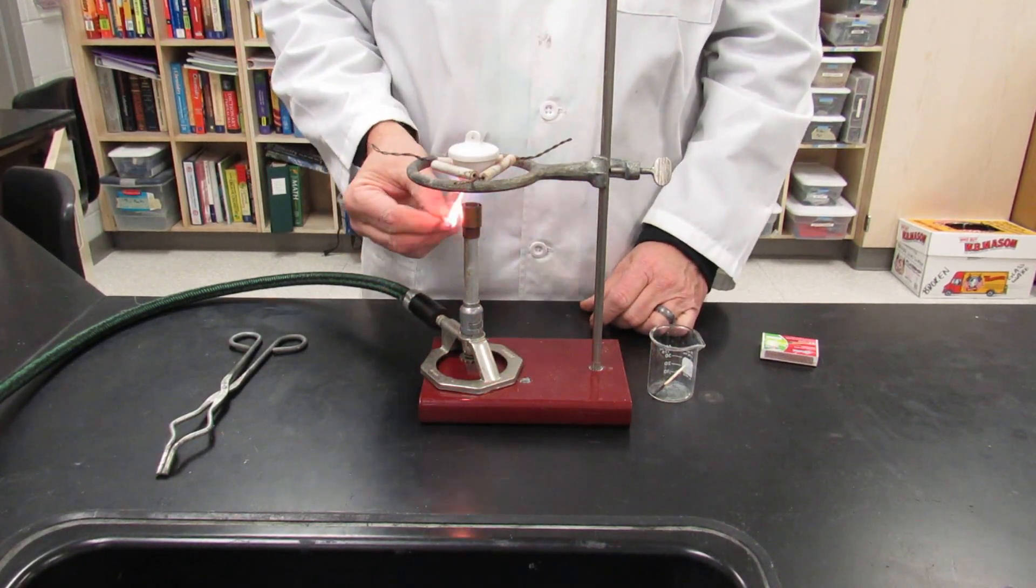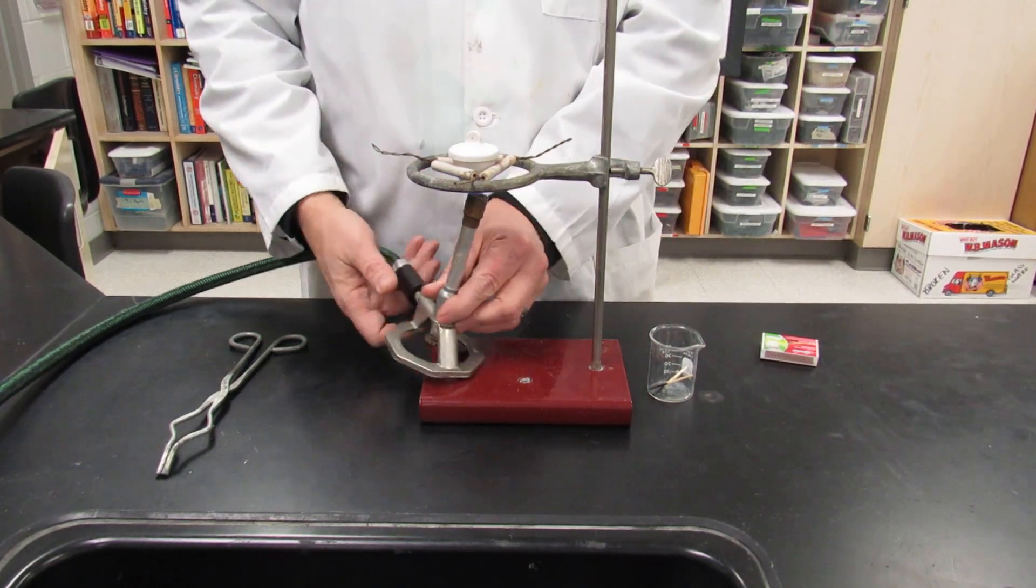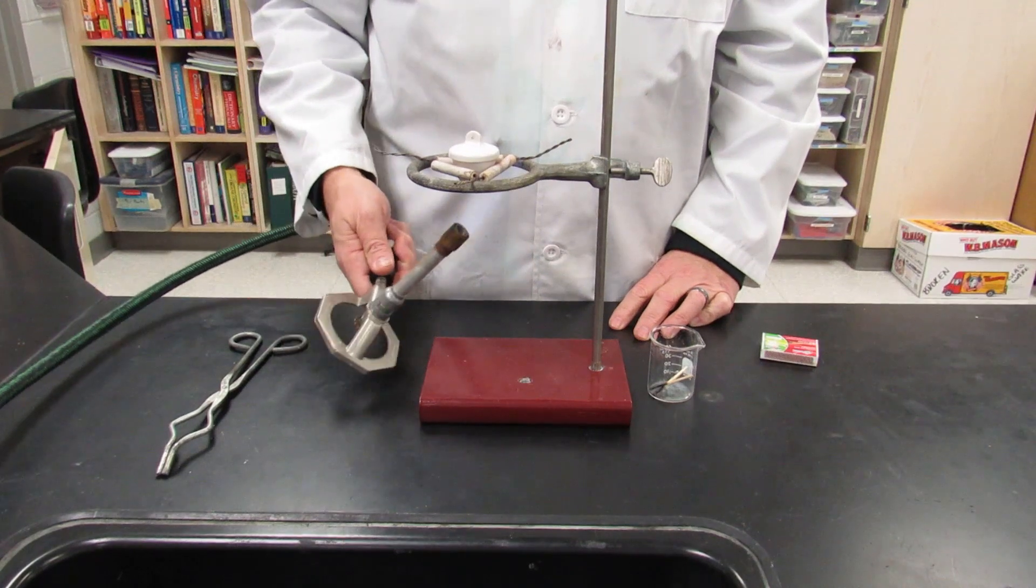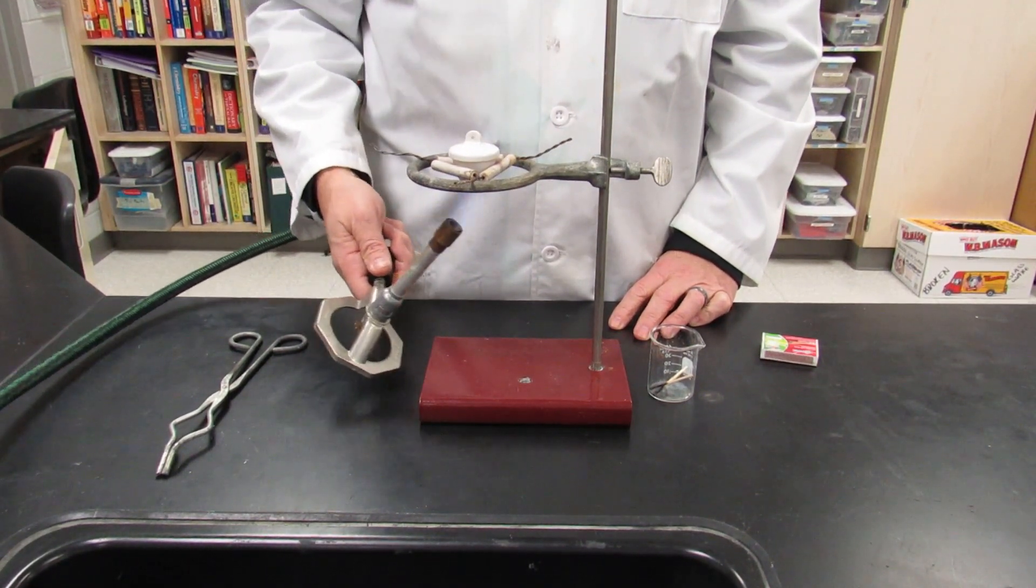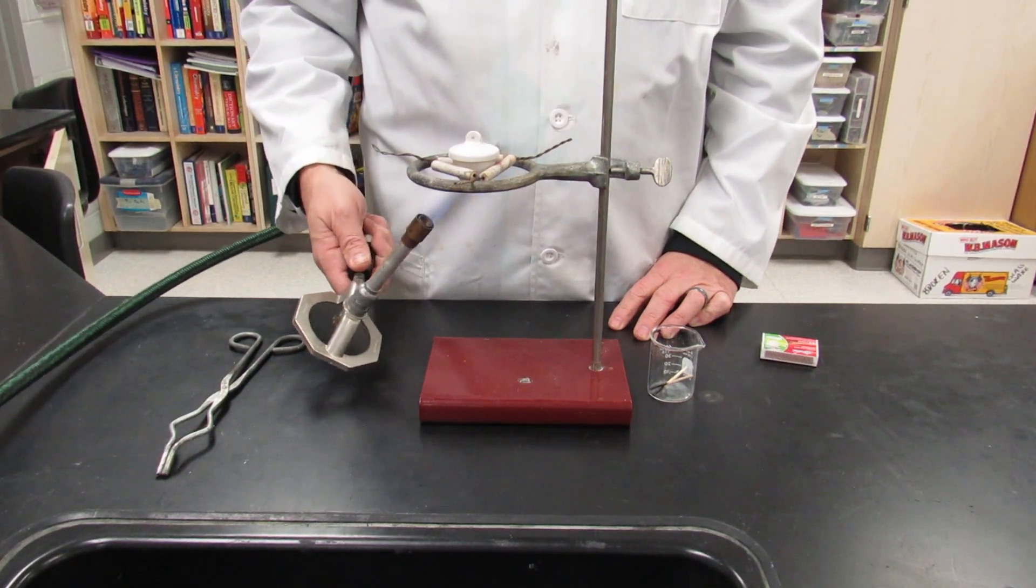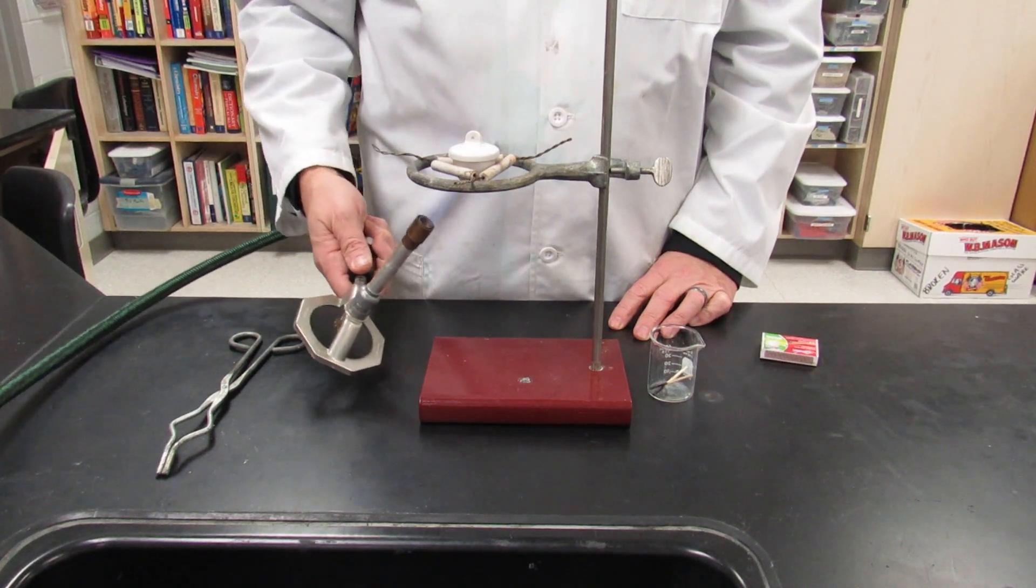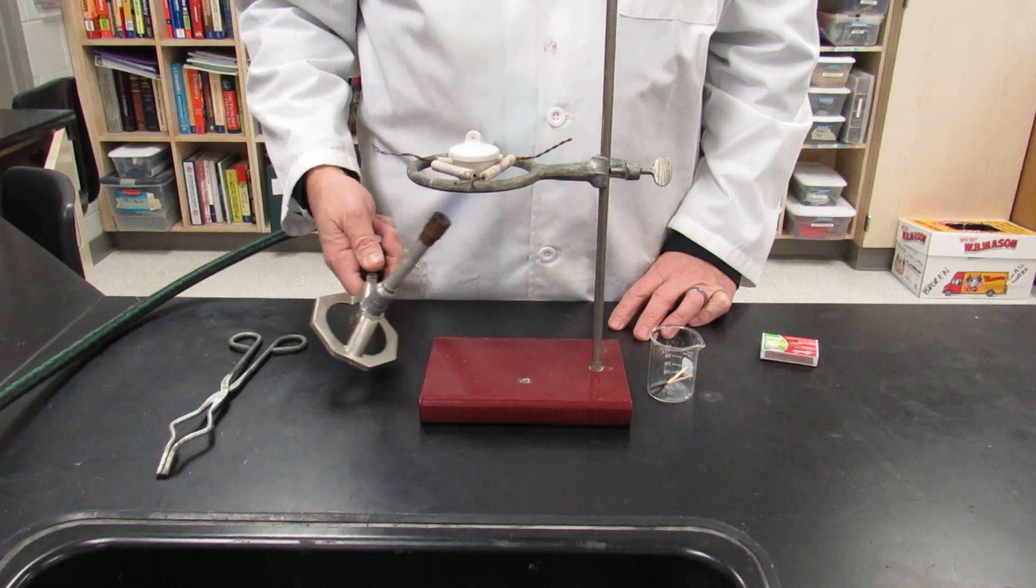And then gently run your flame underneath of your crucible for a couple minutes in order to drive off the water that may be in the crucible. Be patient with this. It does take a little bit of time.